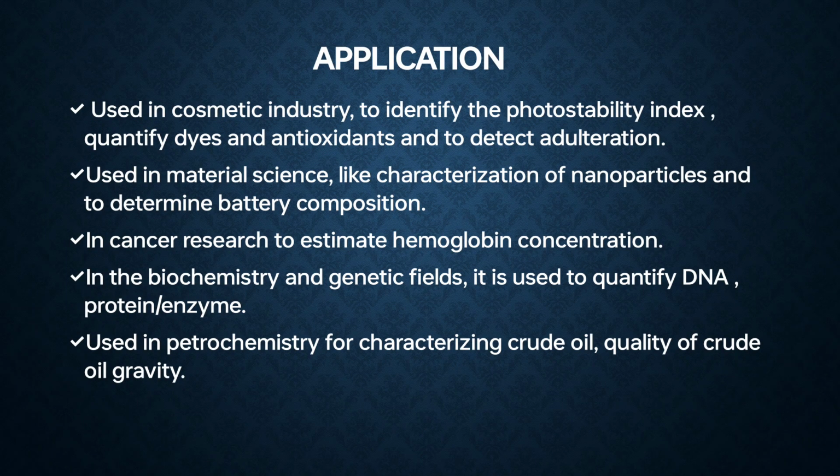Application. UV visible spectroscopy is used in the cosmetic industry to identify the photostability index, quantify dyes and antioxidants, and to detect adulteration.